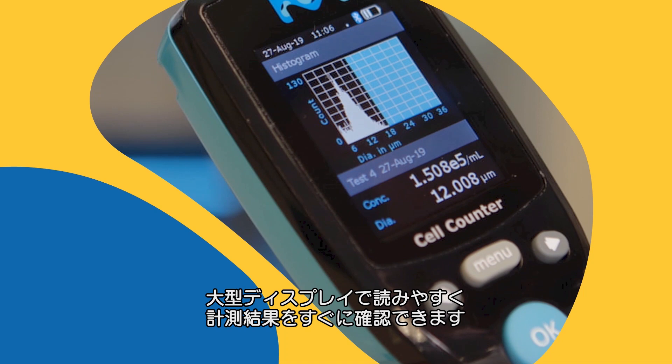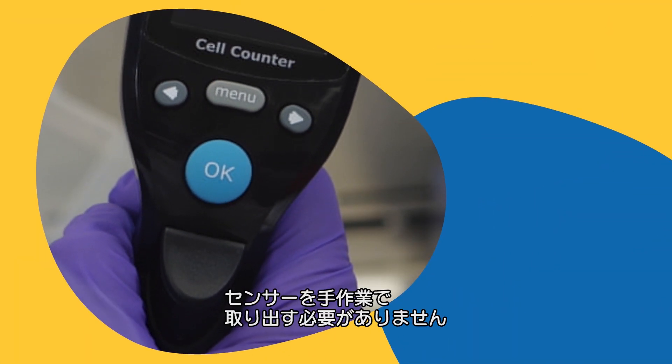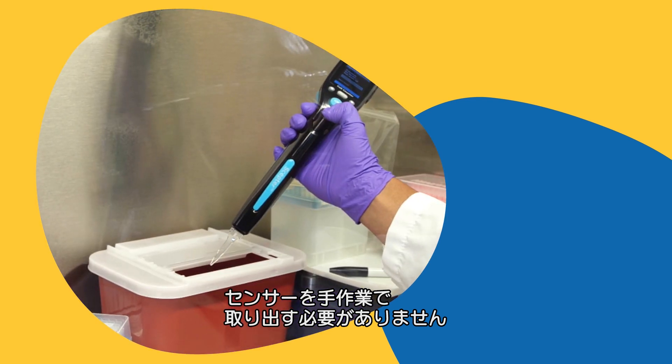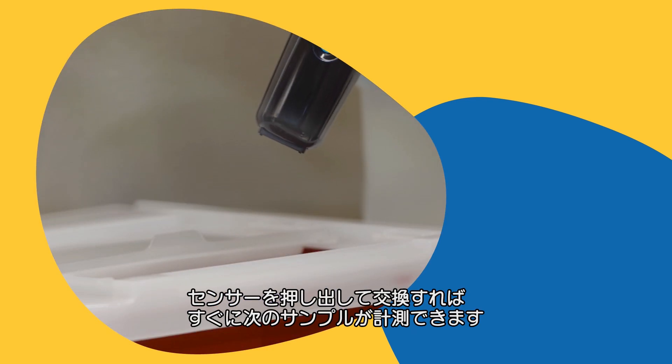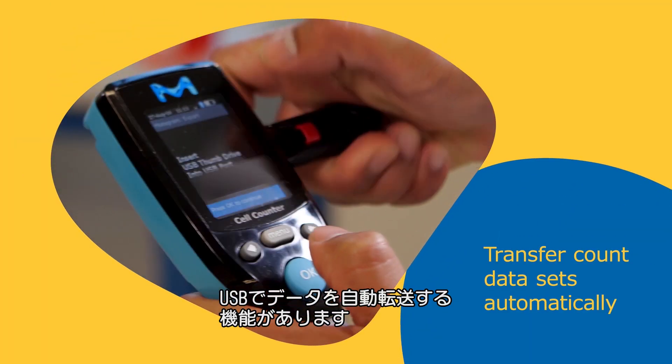The large, easy-to-read display provides instant confirmation of count. The ergonomic sensor ejector button eliminates the need to manually remove the sensor. Eject the sensor and you're ready to count the next sample.